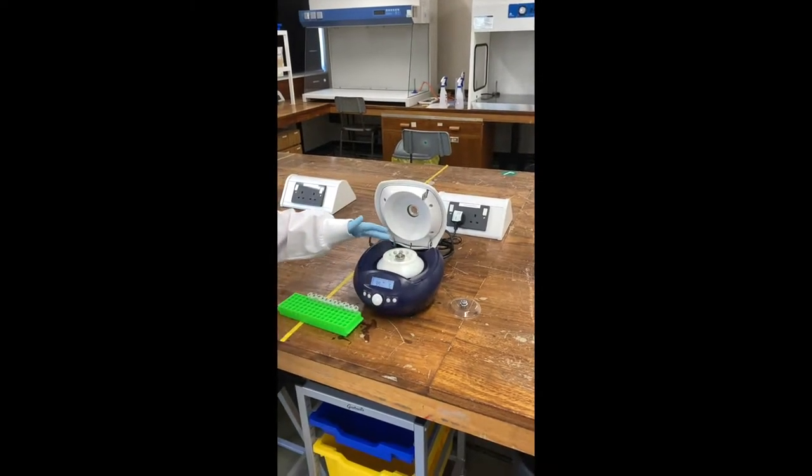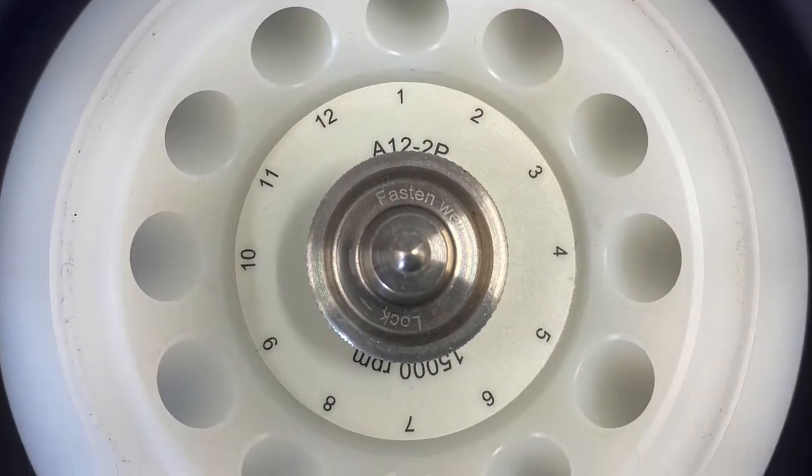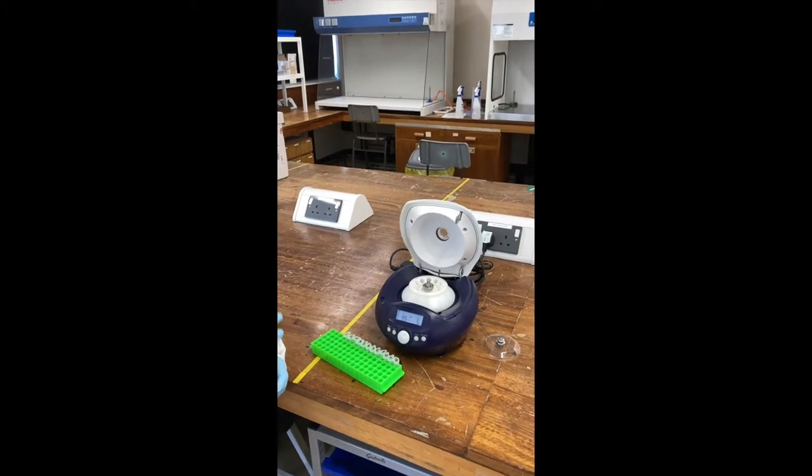The first thing you'll notice is the various holes within the centrifuge. This one will go up to 12, they're the different positions you can put samples in. The most important thing when you're using a centrifuge is to make sure that it's balanced.